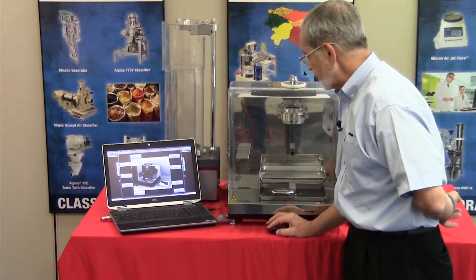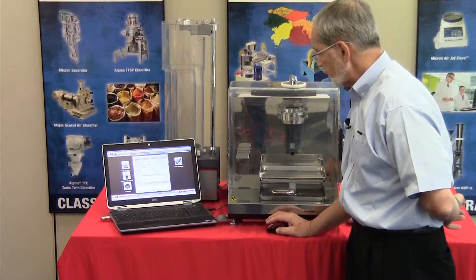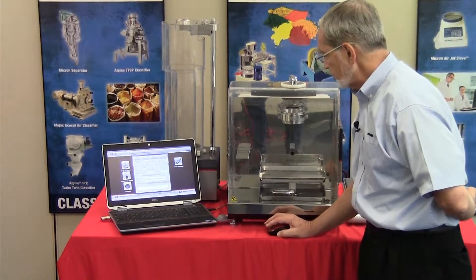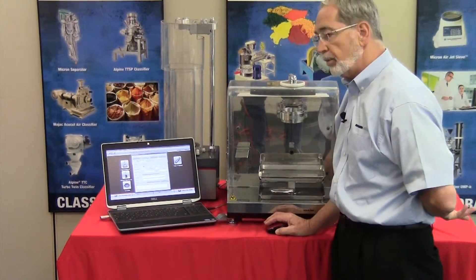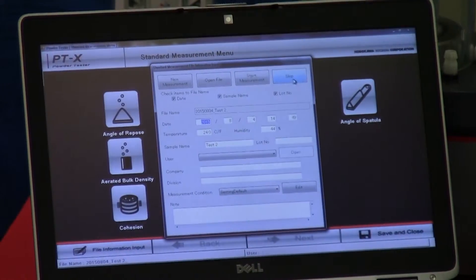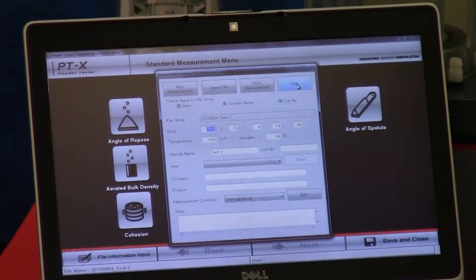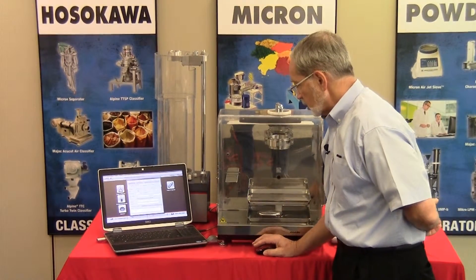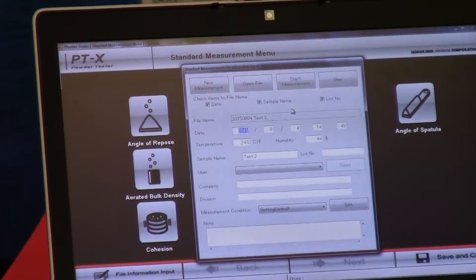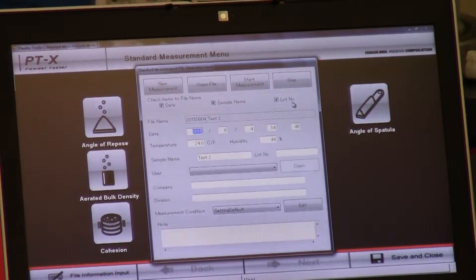Once this is all set up, now we get into the starting. To start the measurements, we go over to Standard Measurement. This screen first pops up. What we do here is we can identify a new measurement, open an existing file, start the measurement, or skip. If I skip, it will ask me for the same information before the conclusion of any analysis to save the data. The various fields ticked off here are used to develop the file name — in this case we have the date, the sample name, and the lot number.